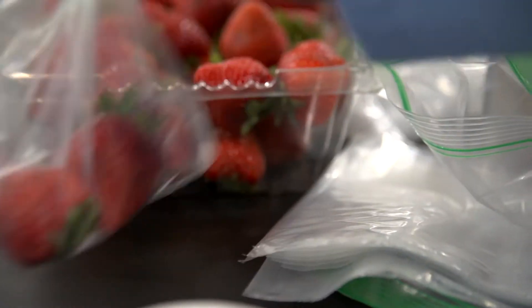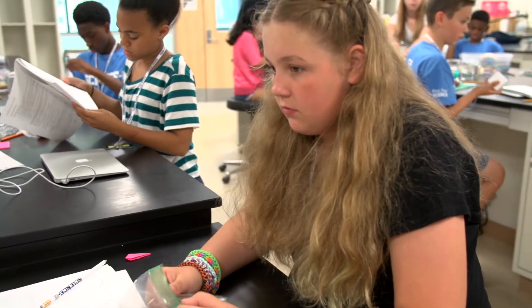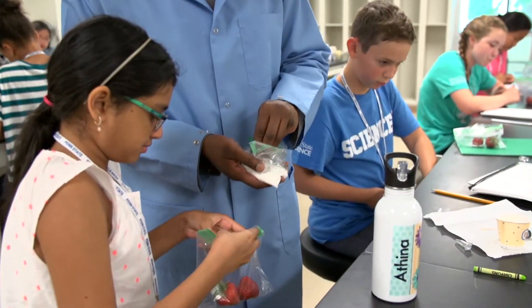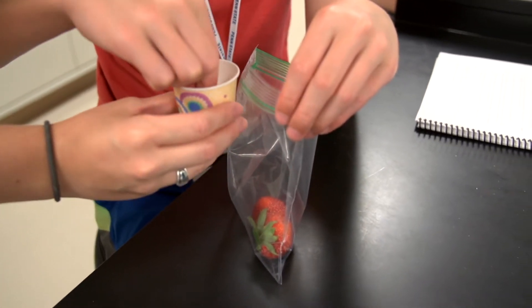Every living thing on Earth has DNA. So to prove it, the campers would use the same procedure to extract DNA from strawberries. Strawberries have more copies of the chromosomes than humans do — humans only have two copies and strawberries have eight.